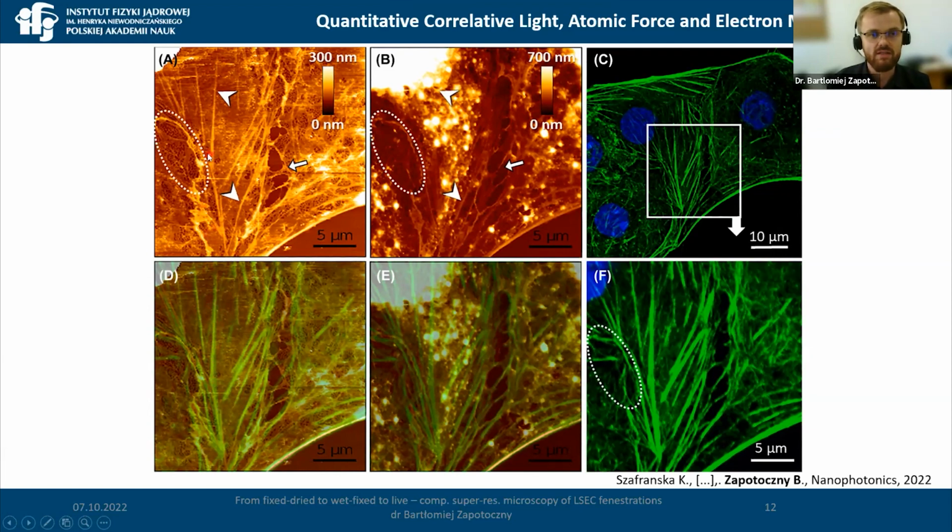And finally, we can extrapolate this to the previously shown animated 4D images, so with time studies, to somehow provide this lacking information about the protein of interest. And that is the part that we are now focusing on.